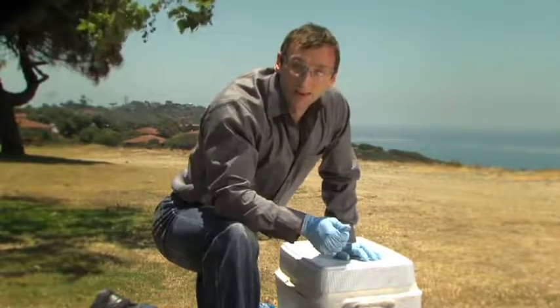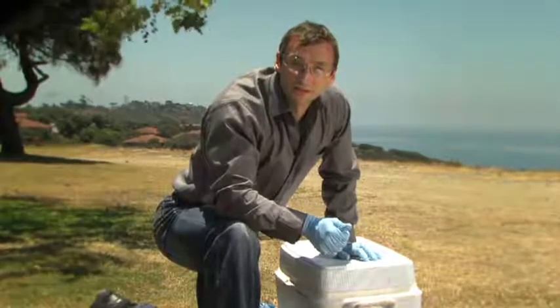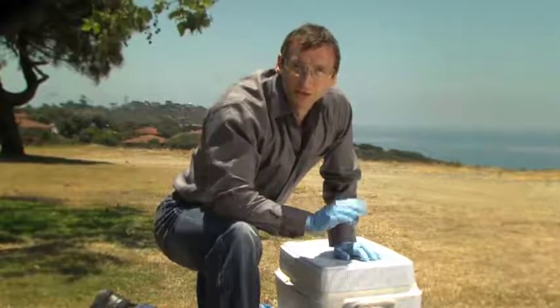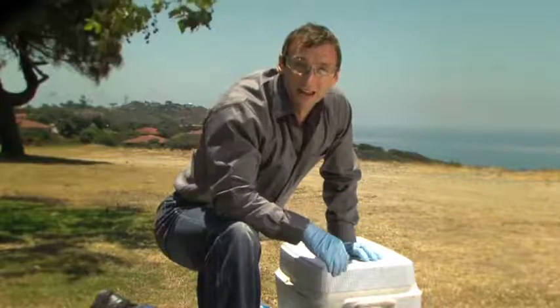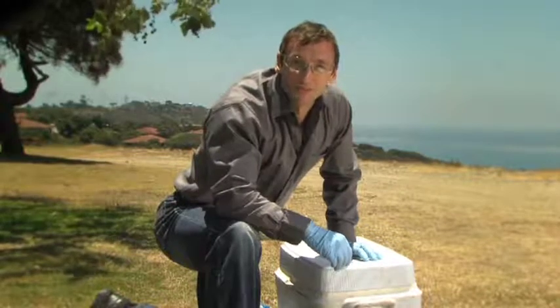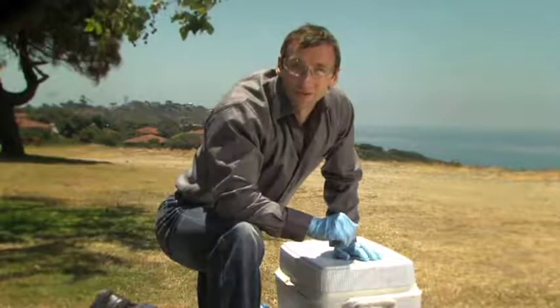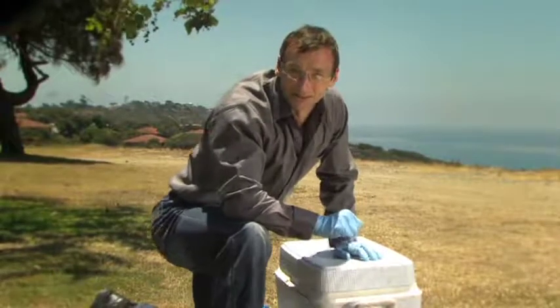If transport by a commercial overnight delivery service is available, their paperwork satisfies the chain of custody requirements. Be sure to keep copies of your records and to check and ensure that the samples were delivered on time. But in our case, since our lab is nearby, we're going to transport them to the lab ourselves.